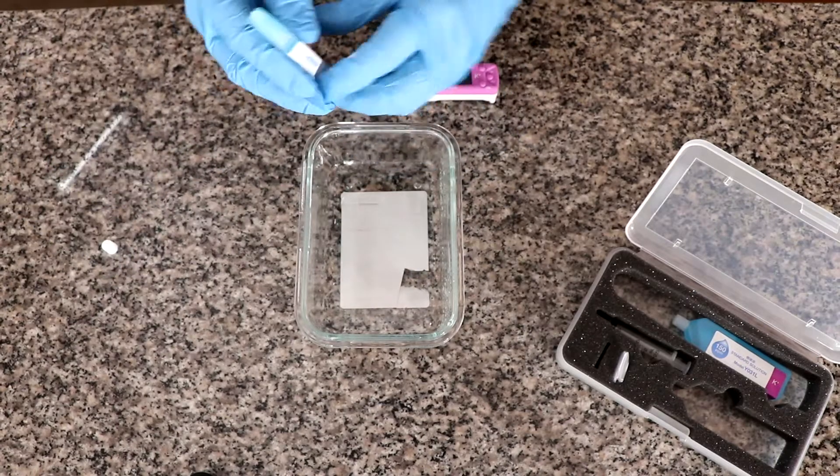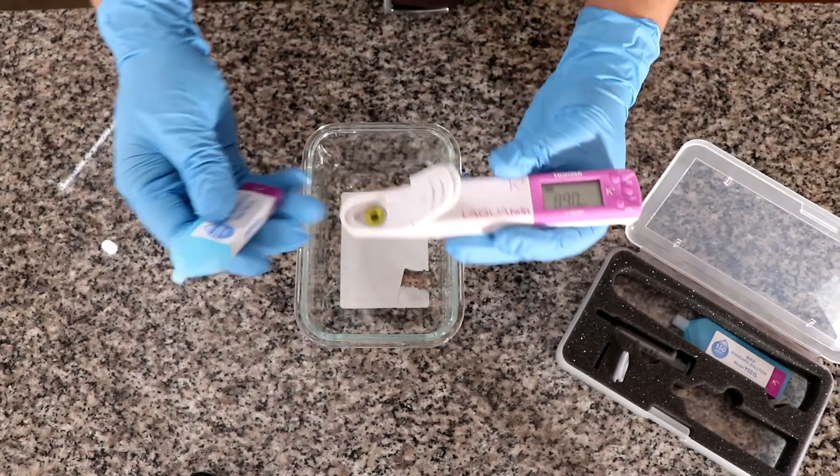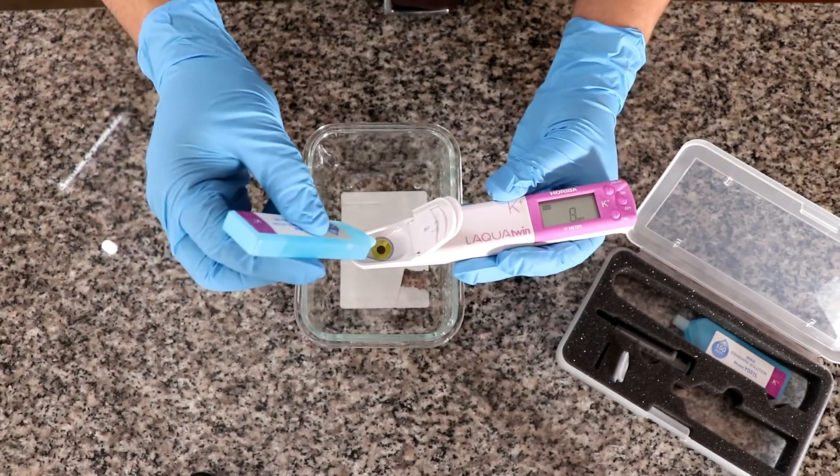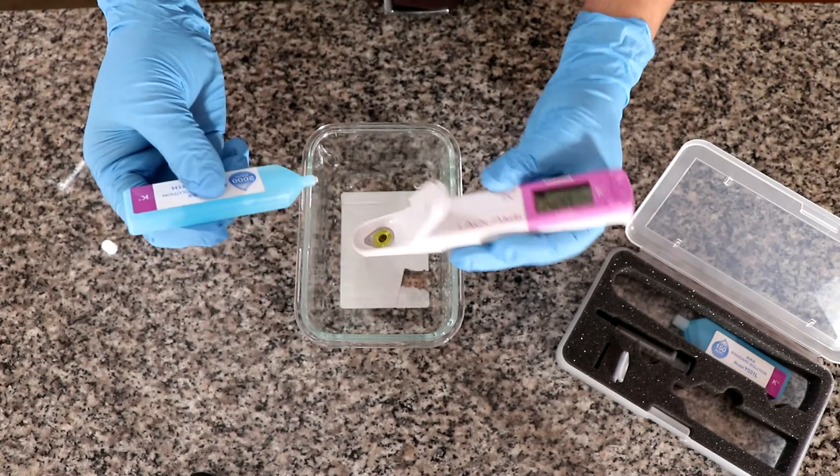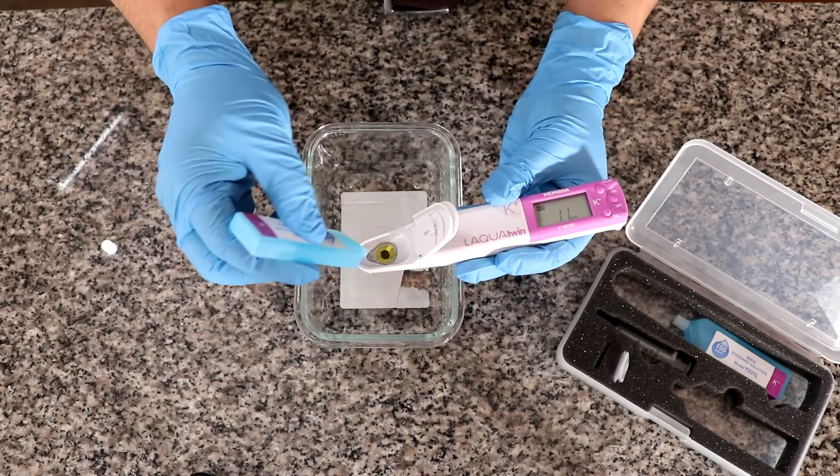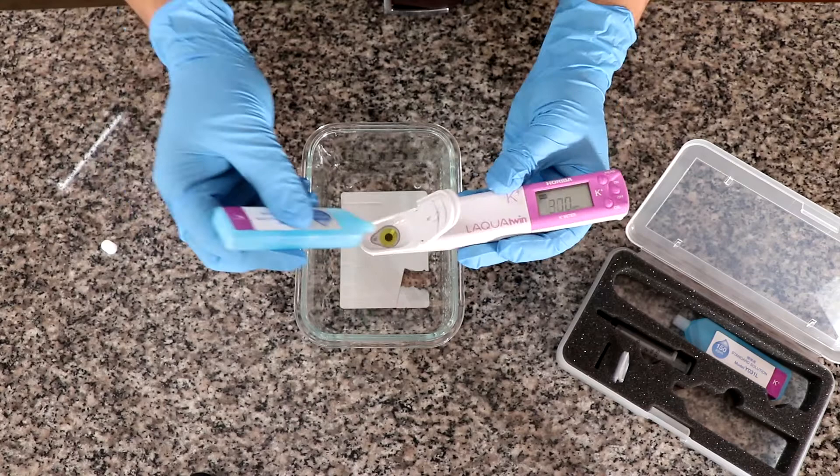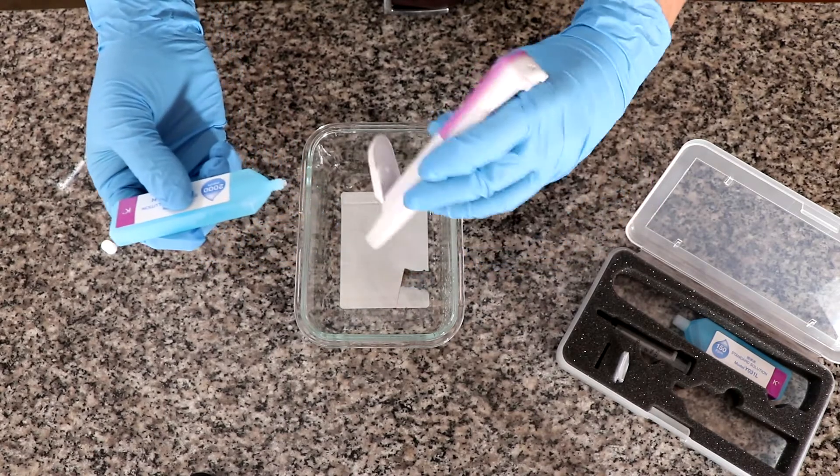I'm going to open it and then I am going to do the same thing I did last time. Squirt a little bit, dump it, a little bit, dump it, a little bit, dump it.